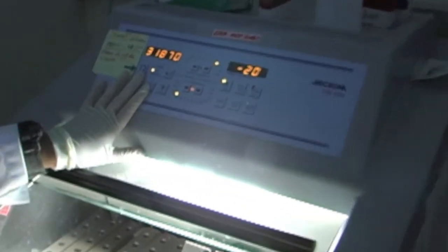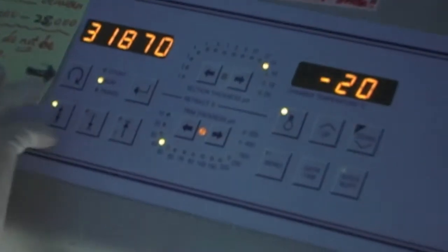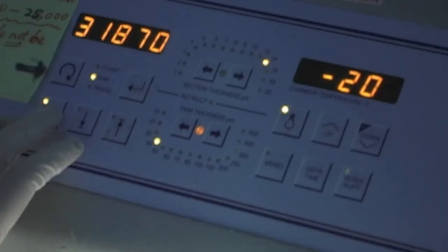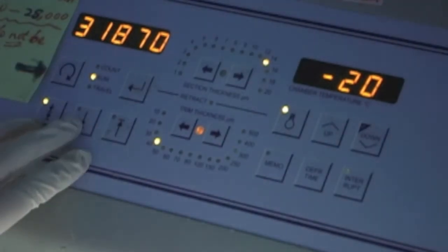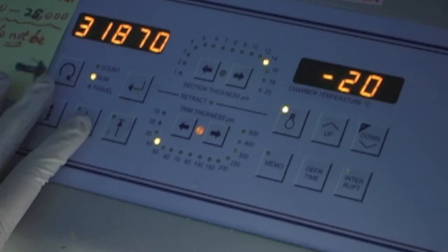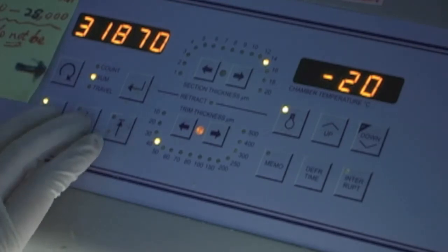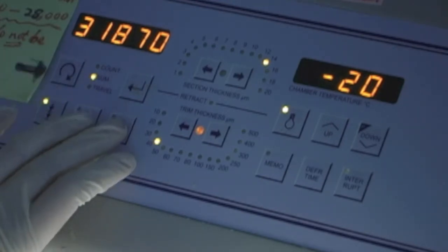In order to begin cutting the brain, we must first make sure that the Cryostat is on the correct settings for brain verification. Using this control panel, we can control everything about the Cryostat, from the thickness of the slices to the temperature of the machine.